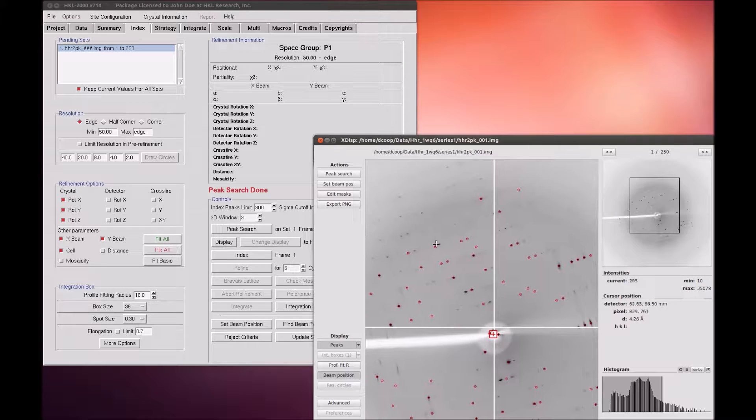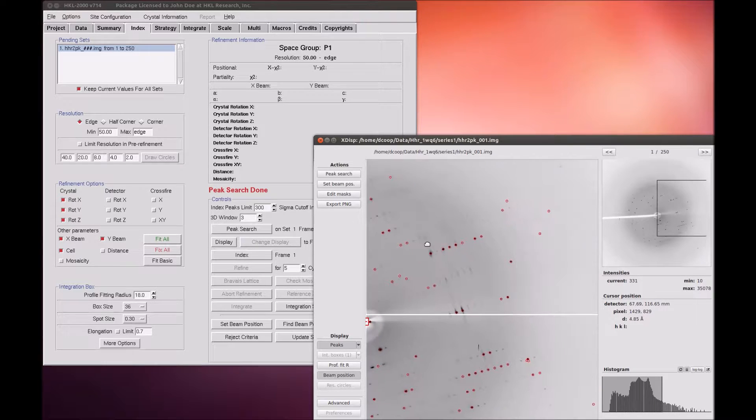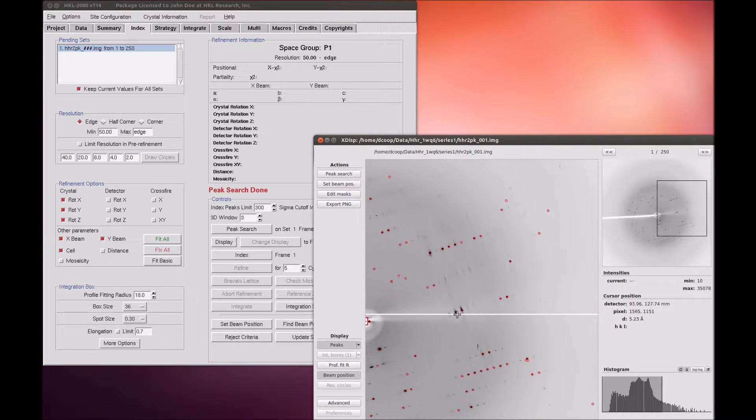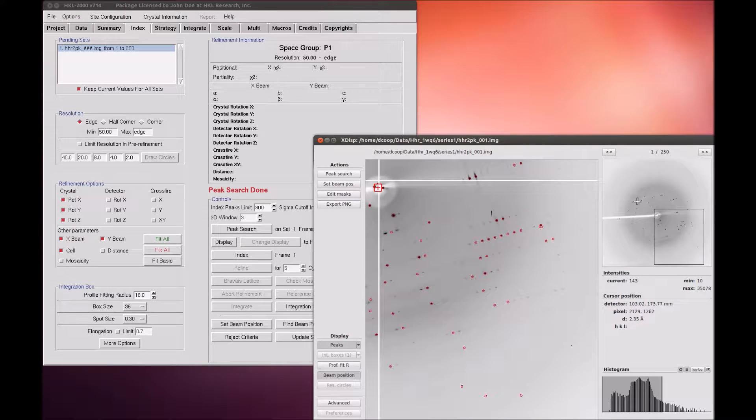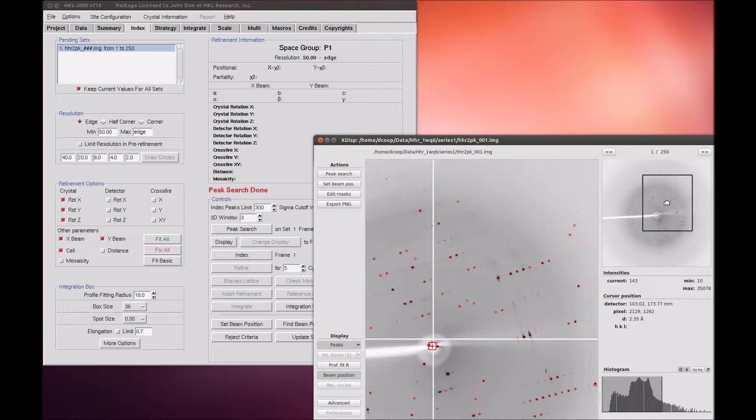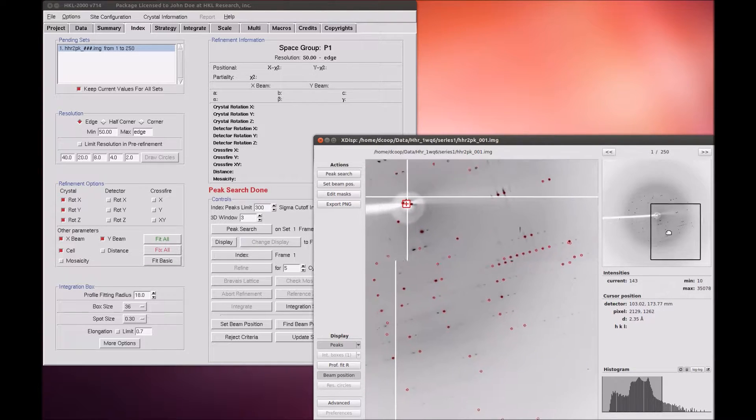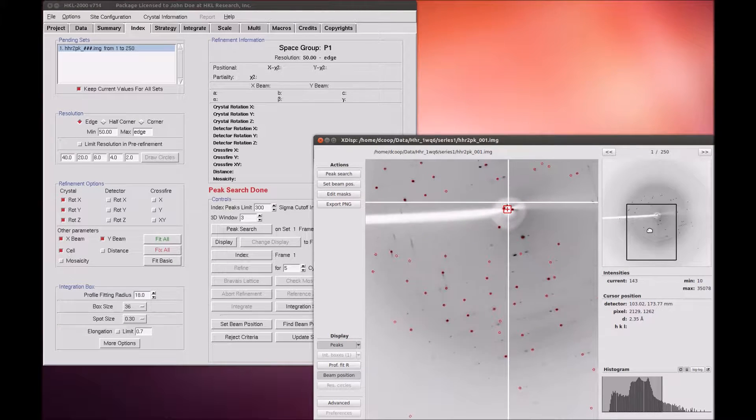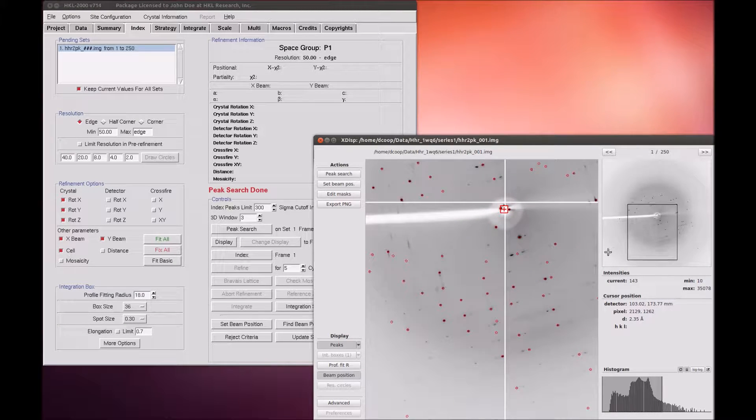To scroll around the image, click and drag the image with the left mouse button, or drag the zoom box around on the image thumbnail on the top right.